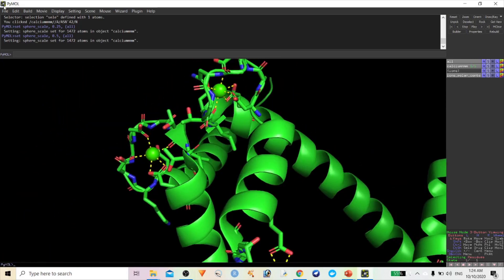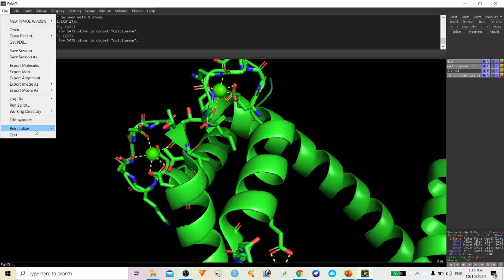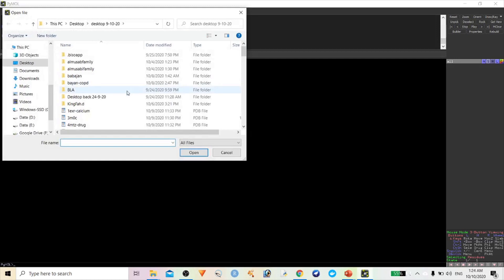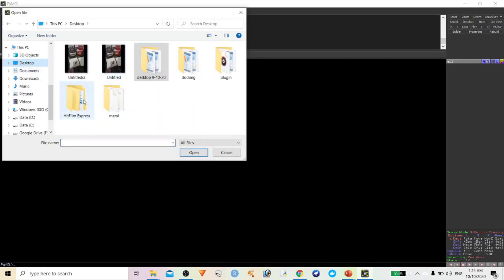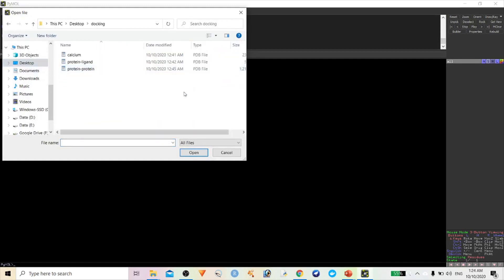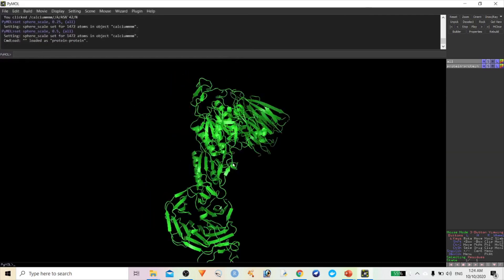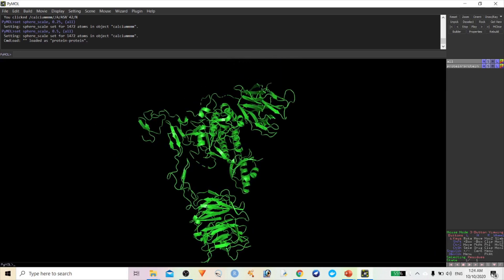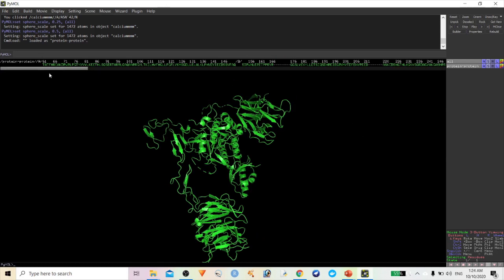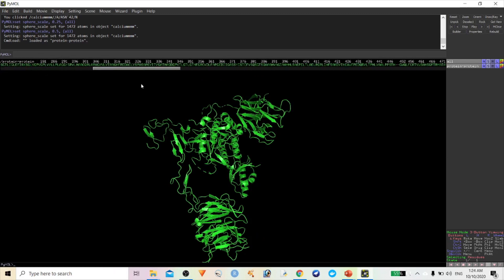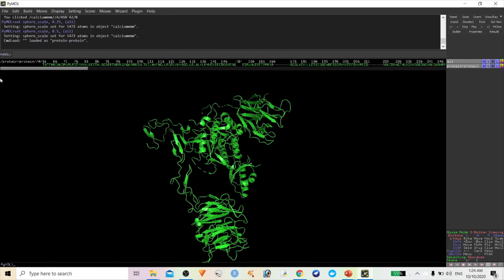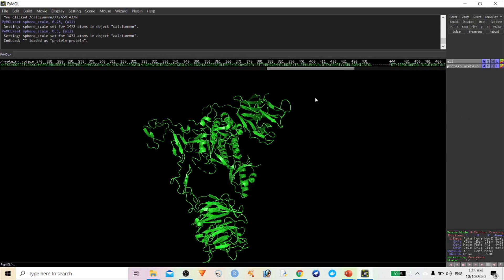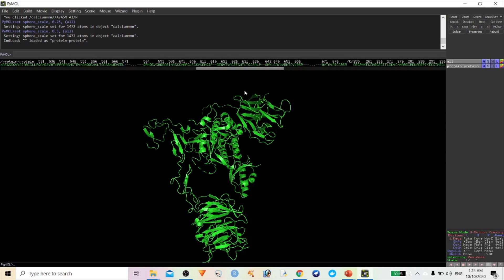Let's see one more thing — protein-protein interaction and how to perform it. Here are three complex proteins: PCSK9 bound with the LDLR receptor. There are three different chains — chains A and B belong to PCSK9, and chain C belongs to the LDLR receptor.